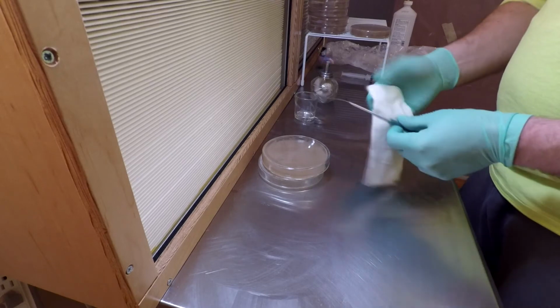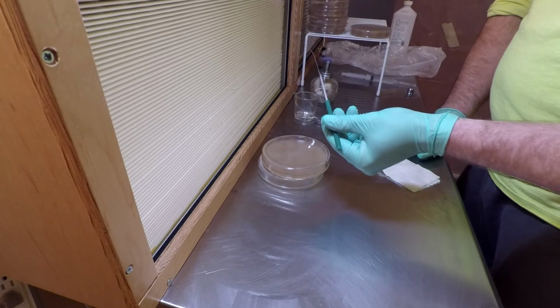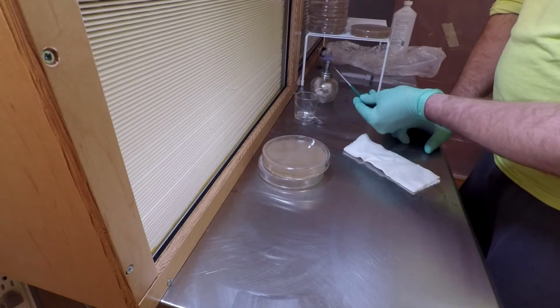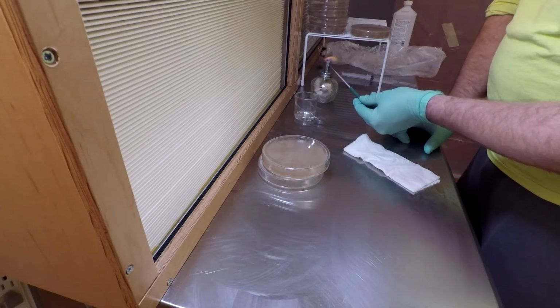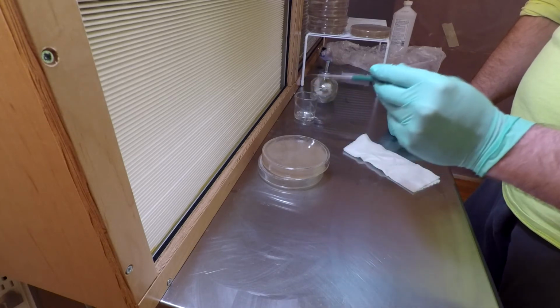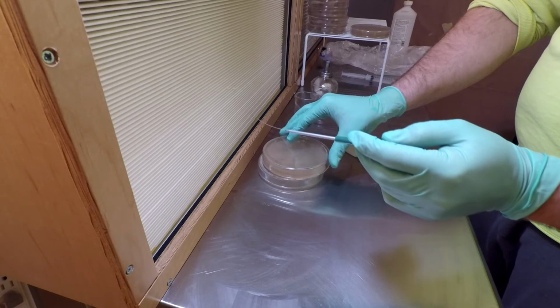So I have my inoculation loop. I'm going to give it a clean up. The alcohol dry off. And I'm going to heat the end of the loop until it gets red hot. It's important to get red hot because that'll be hot enough to kill any bacterial spores on it. So keep it in the blue part of the flame, and then let it cool off. You can also dip it in the fresh agar dish to cool it off faster, like so.